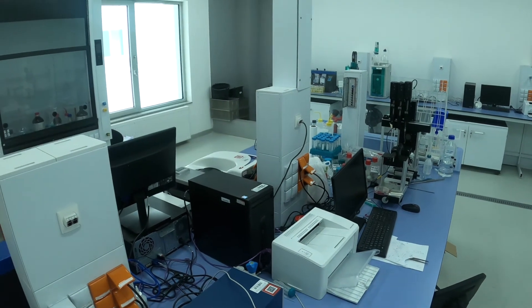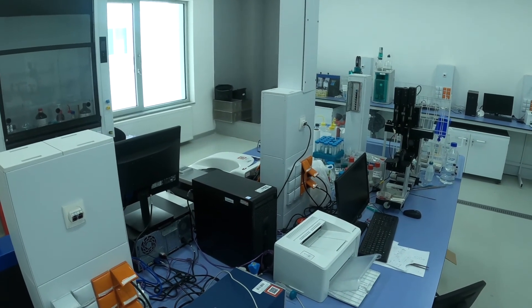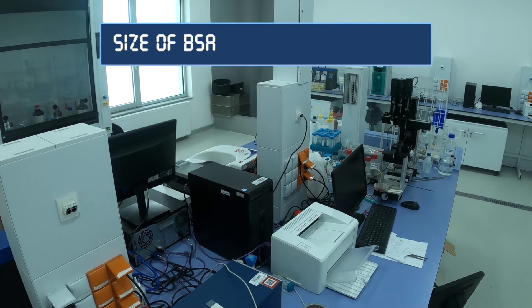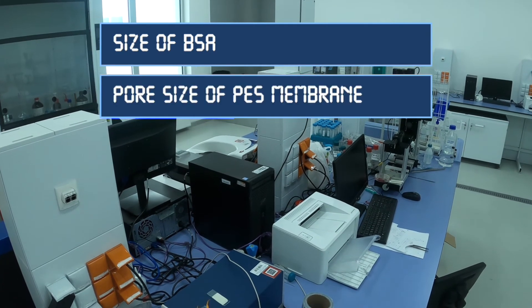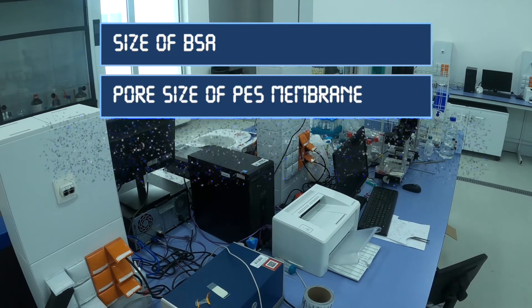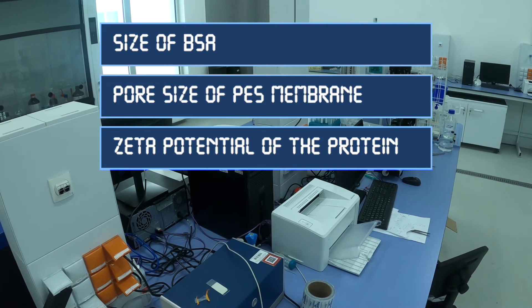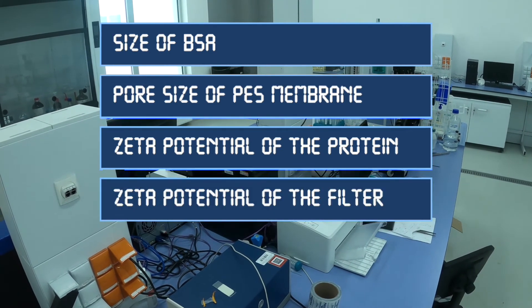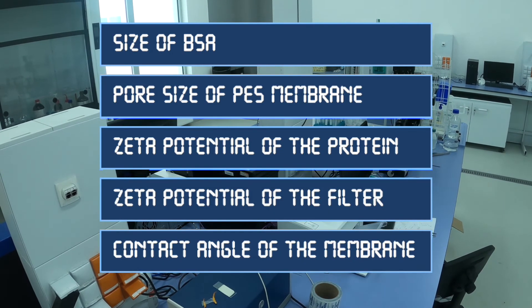Dear students, finally you know the size of BSA, pore size of PES membrane, zeta potential of the protein, zeta potential of the filter and contact angle of the membrane.